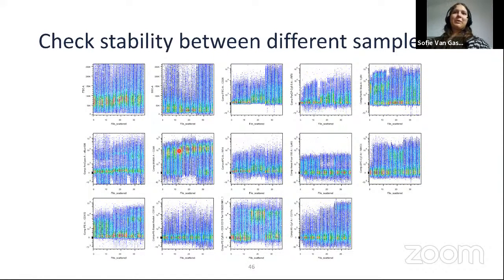If you look at this for a bit, you will notice there are 3 groups, right? I think this is one where it's pretty clear that here in the middle, we really have a very different pattern happening than on the other 2 ends. And actually, I think in most markers, the same thing is going on. There are clearly 3 groups. There are, of course, 2 options. It could be that it's just 3 biologically different groups, like maybe we had with the example with the mice beforehand. This could make sense.